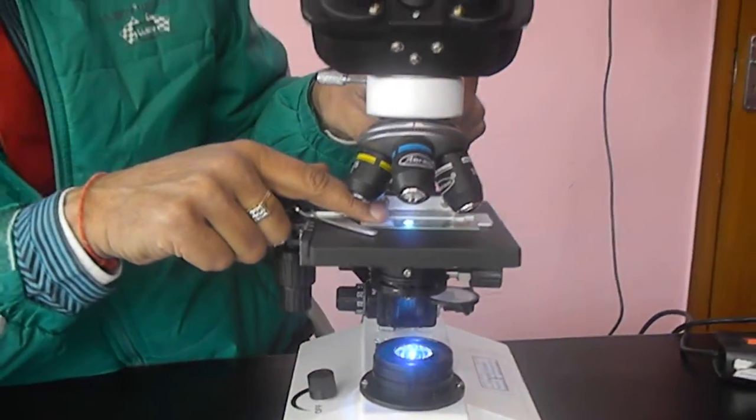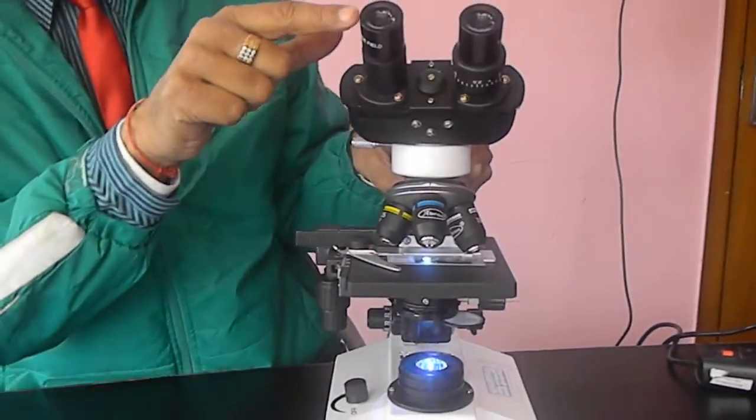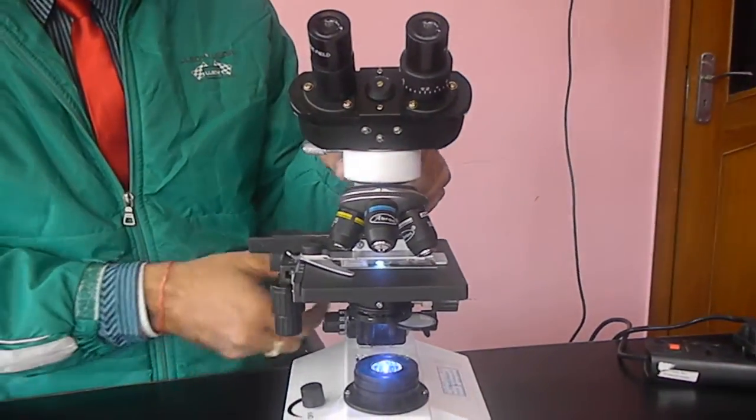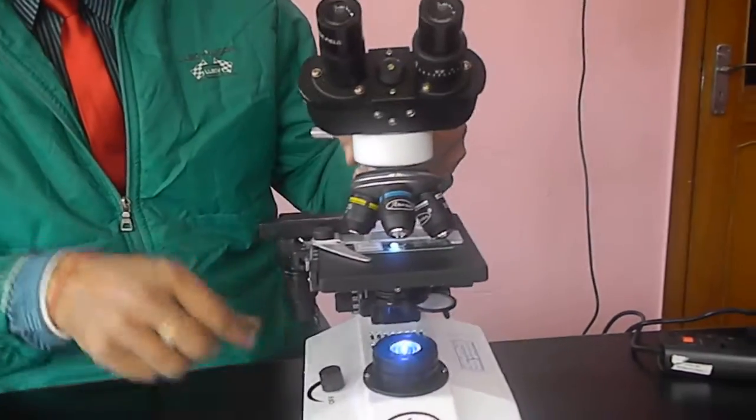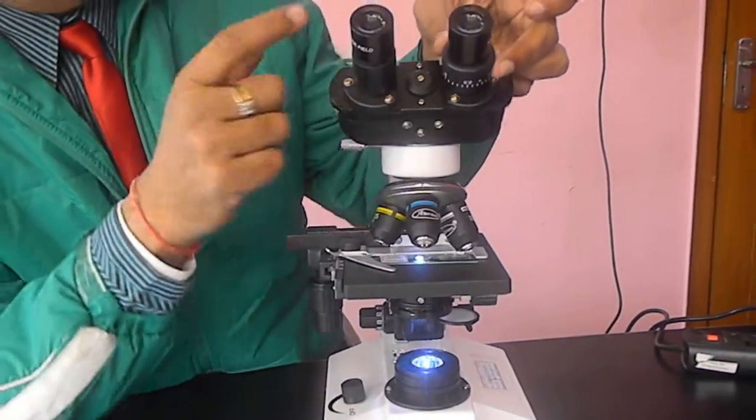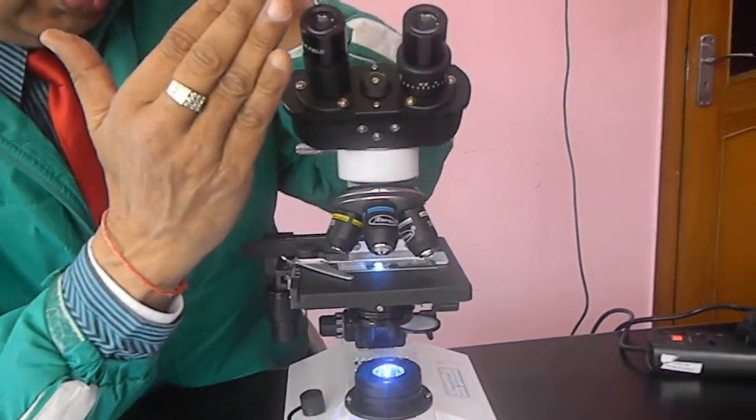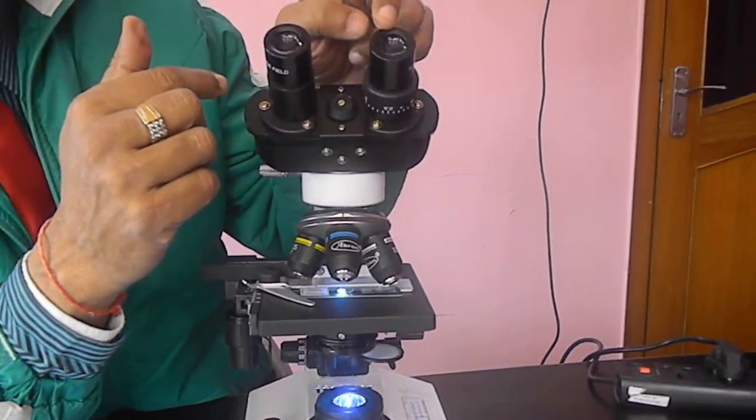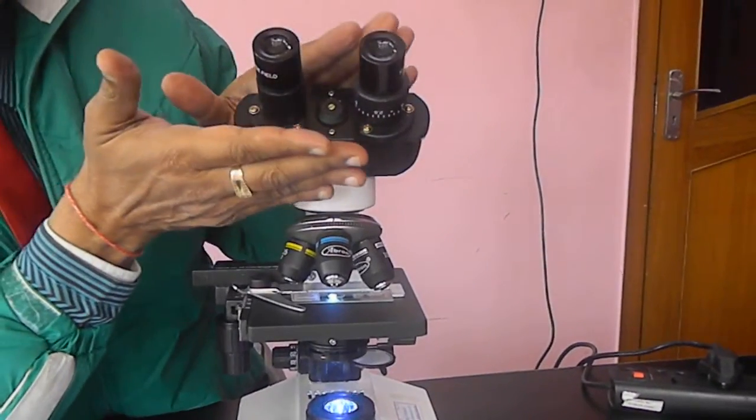Then focus the 10x eyepiece with the left hand. This eyepiece is fixed. Focus this using the focusing knob, and then closing your left eye with your hand, you can focus the other with this. Now both eyes will be adjusted to your focus. This is the first step.